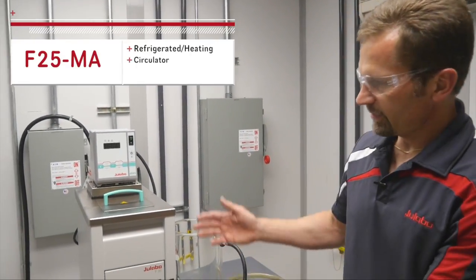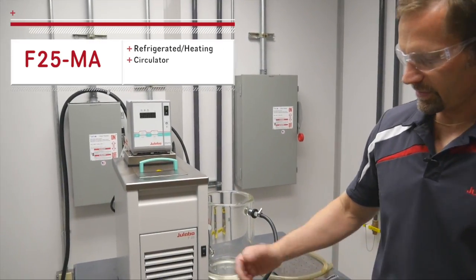Welcome to JULABO. Today we will discuss changing bath fluids in your JULABO circulator. Today we have an F25MA and we'll go through the draining process.